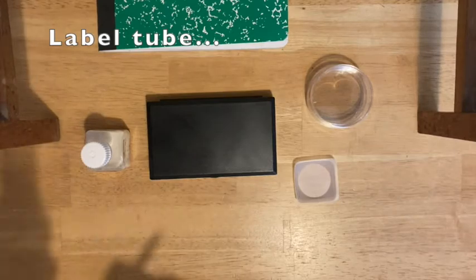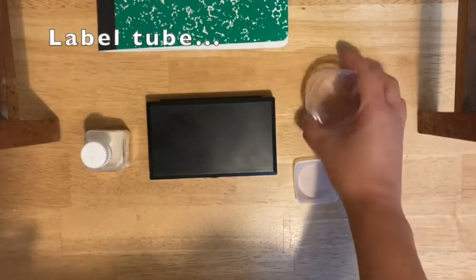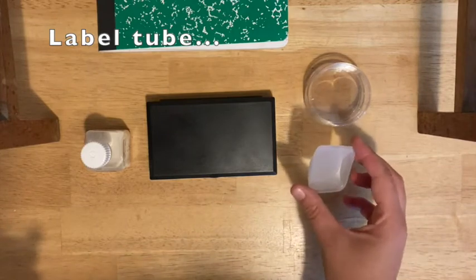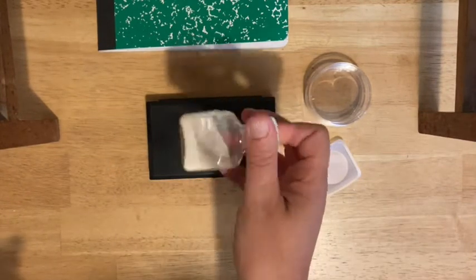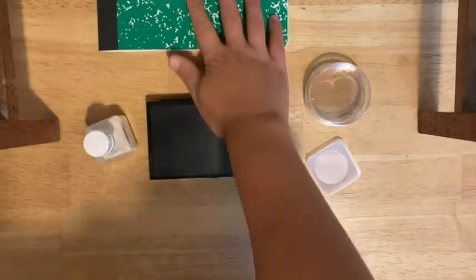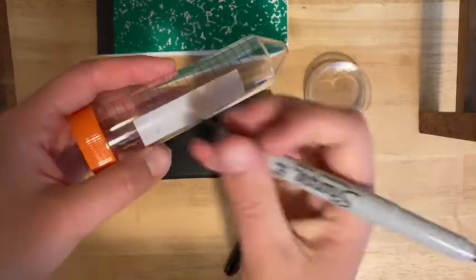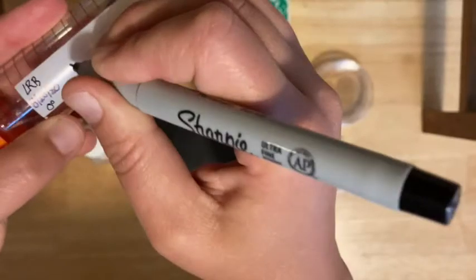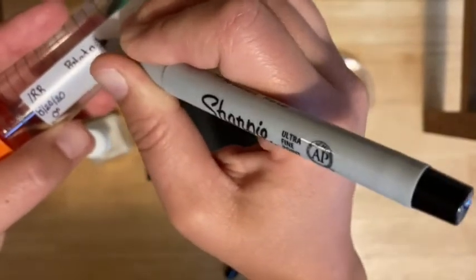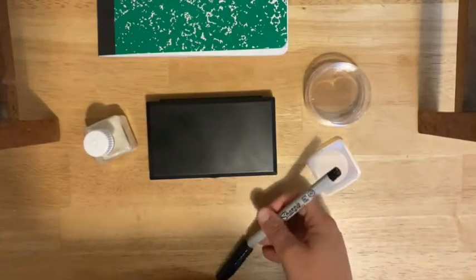Go ahead and gather your materials: your tube and your Sharpie, your stack of two petri plates — keep them closed — your weigh boat, your balance, and a little packet of potato dextrose agar. Mine's in a bottle; yours may be different. You also want your notebook. Go ahead and label your tube with your initials, date, period, and then what's going to be in it, which is potato dextrose agar.